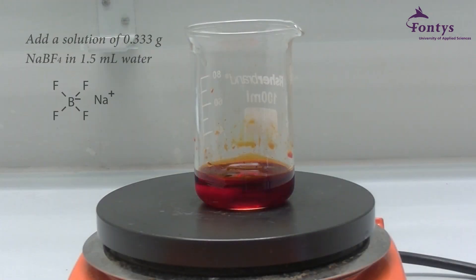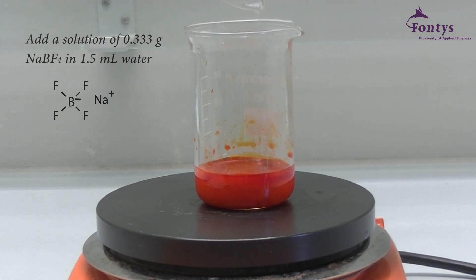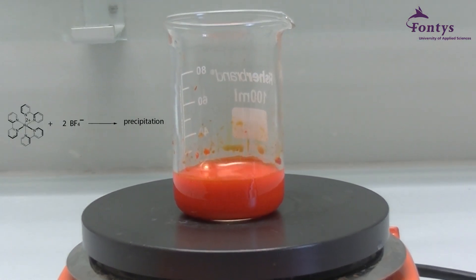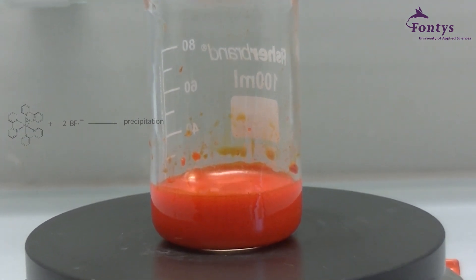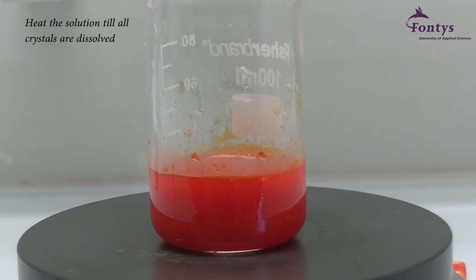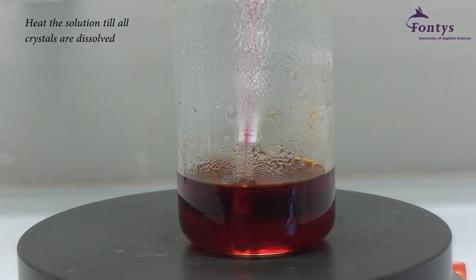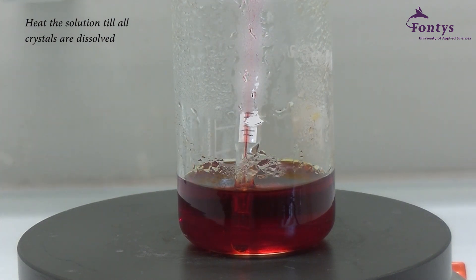First we make a new solution of 0.333 grams of sodium tetrafluoroborate in 1.5 milliliters of water. This new solution will be added to the ruthenium solution. You instantly see the formation of crystals. Heat the solution till all crystals are dissolved. When the solution becomes clear, turn off the heater. Cool the solution down to room temperature or lower and wait for the crystals to form.